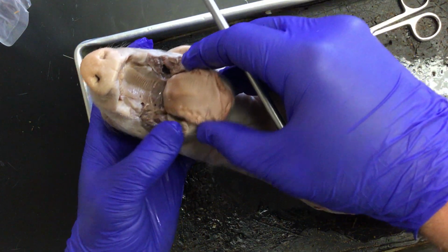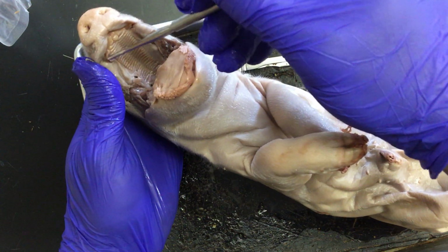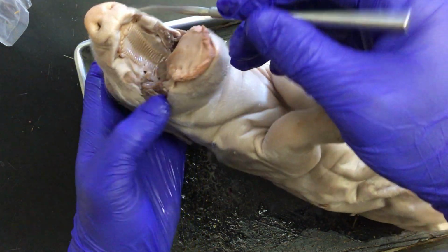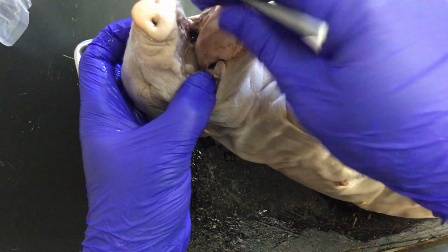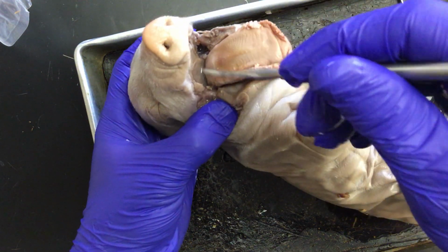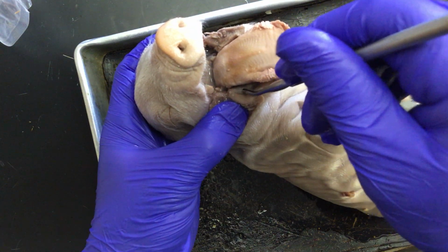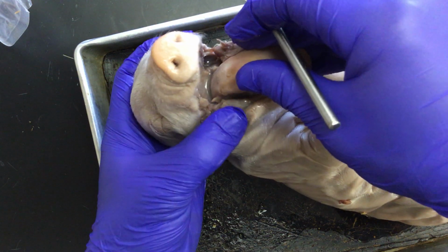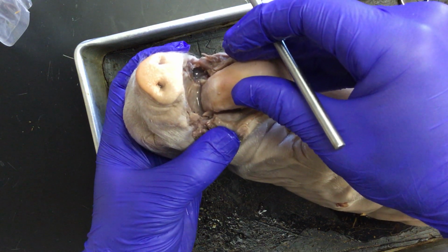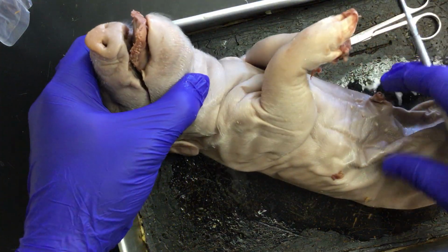Pigs have two types of teeth. They have incisors, which are these sharper front teeth. And then they have what we'll call cheek teeth, what we refer to as molars in humans. They're the rounded teeth toward the back of the mouth that are used for grinding. You actually can't see these cheek teeth yet on this pig because they haven't popped through, because this pig would not yet have been born at this developmental stage.